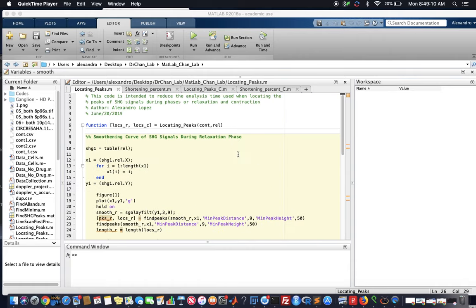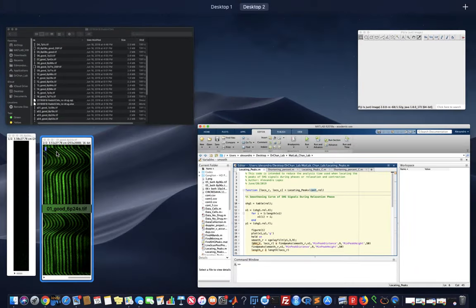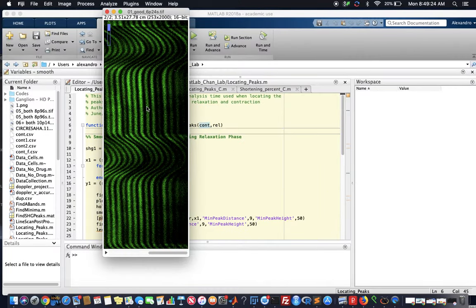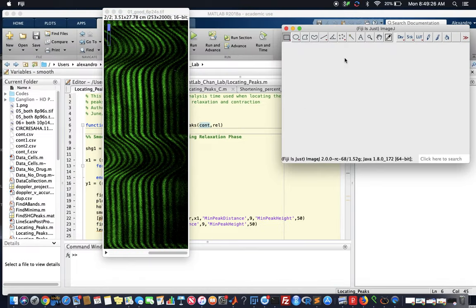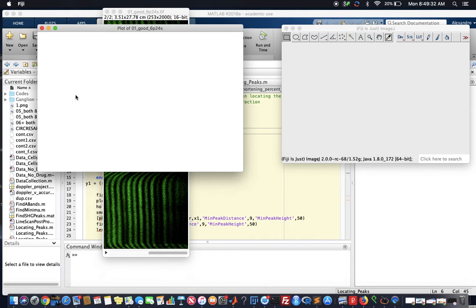This code is being used to measure the shortening percentages of heart cells, and in this video, I will quickly demonstrate how. Alright, so let's start off. I already have these images pulled off here. So quickly, we're gonna get these plots, and then we'll continue. Alright, so then we just do these normal plots as you already know.